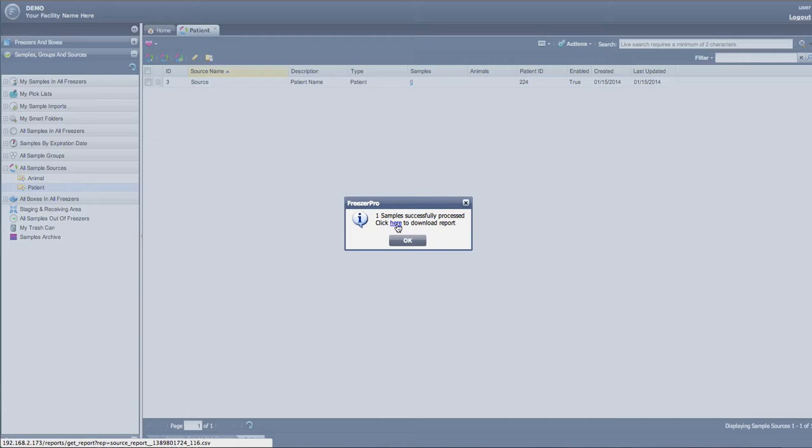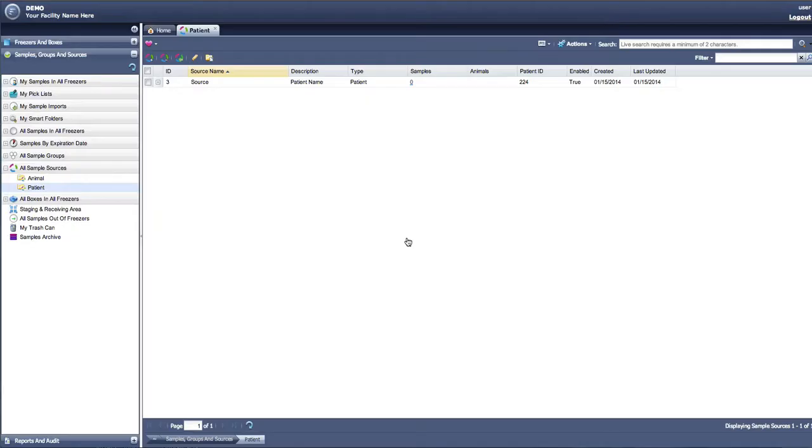This concludes the user working with sample sources video tutorial. Up next, we will discuss managing sample alerts.